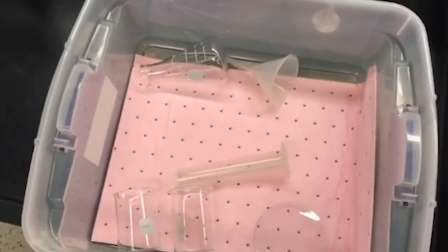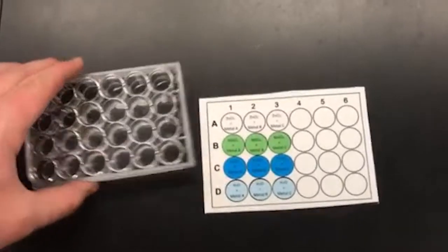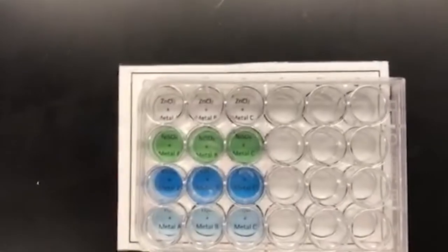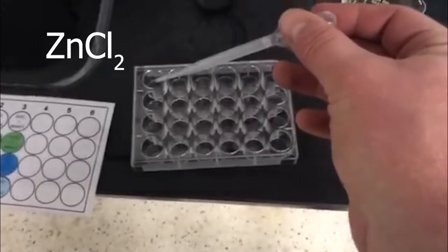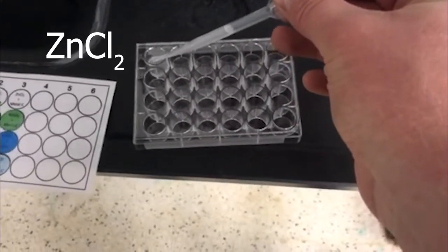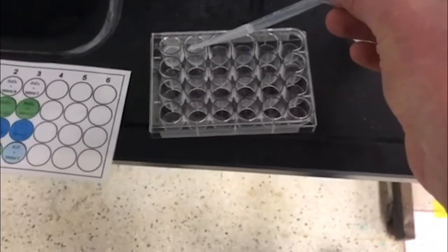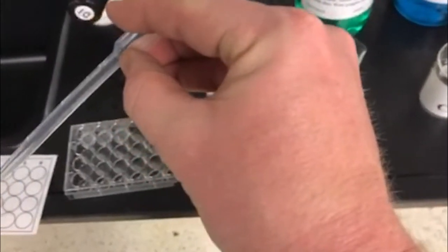Here's our bin. Here's our well plate. Here's our card. Overlay of the well plate on the card. My transfer pipette is filled all the way. Drop, drop, drop. I would say that's a little bit more than a milliliter into each one of them. So that's 3 milliliters. This marking right here is 3 milliliters. So I got about 1 milliliter of each solution into there.